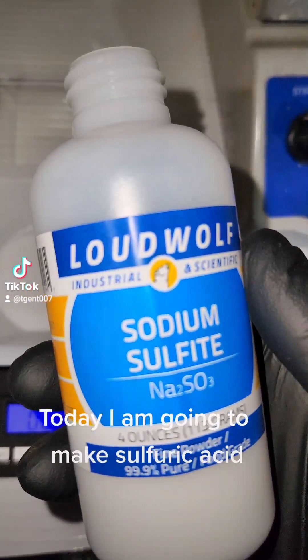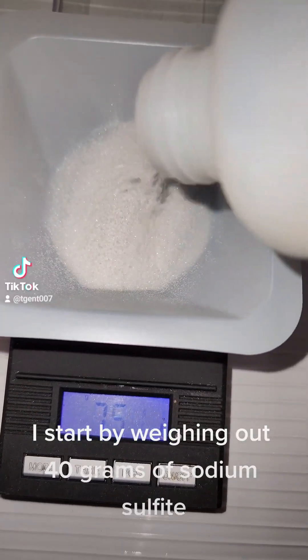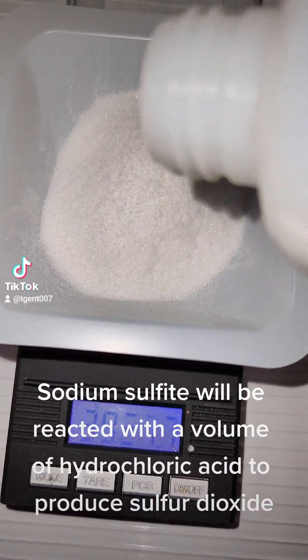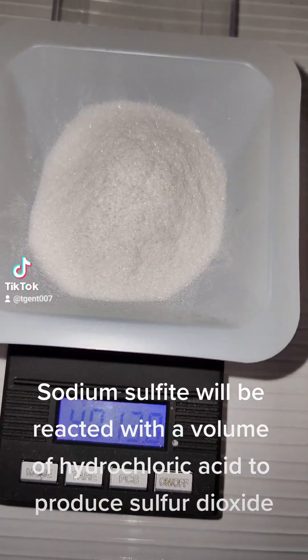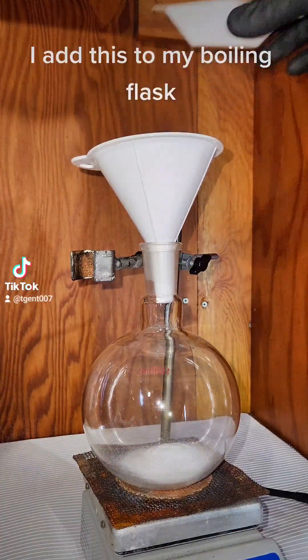Today I am going to make sulfuric acid. I start by weighing out 40 grams of sodium sulfite. Sodium sulfite will be reacted with a volume of hydrochloric acid to produce sulfur dioxide. I add this to my boiling flask.